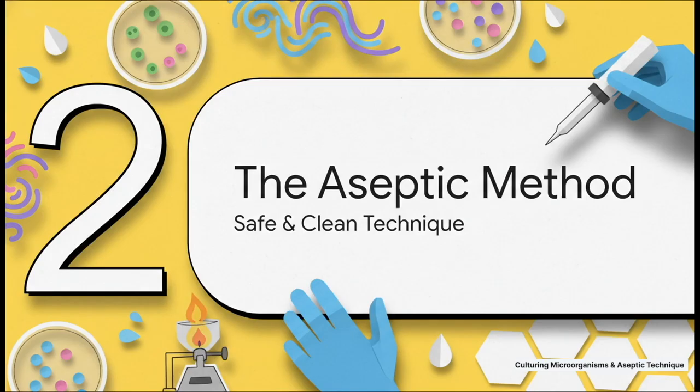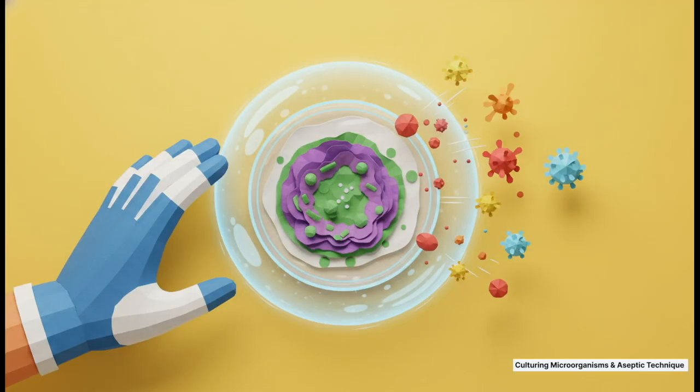The word aseptic literally means without contamination, and trust me, it is absolutely critical. If you get this wrong, your results will be completely useless, and even worse, you could create a serious health risk. So, why all the fuss about being sterile? Well, it boils down to two massive reasons. First, you need a fair test. You don't want any random microbes floating in from the air messing up your results. But second, and honestly, this is the big one, safety. You do not want the bacteria you're trying to grow to escape and contaminate you or the lab.